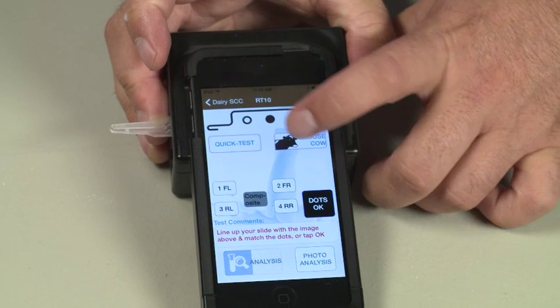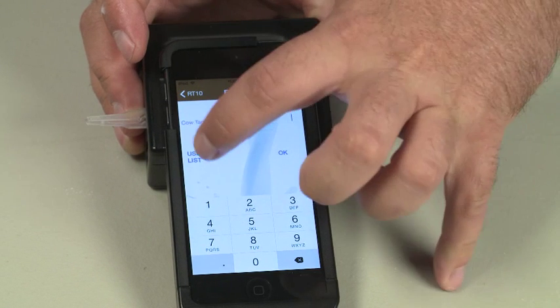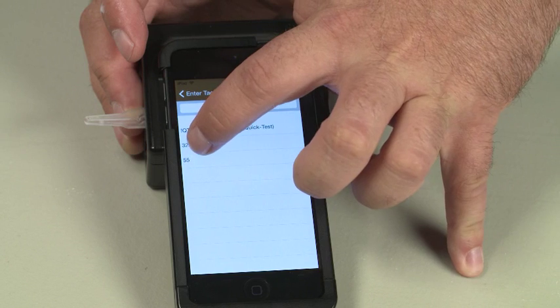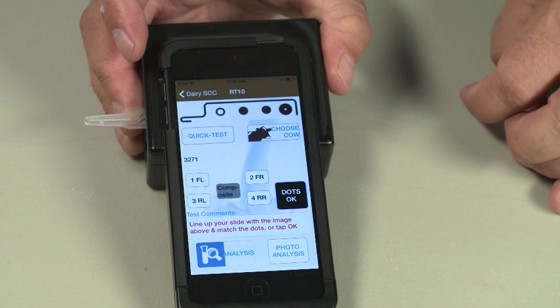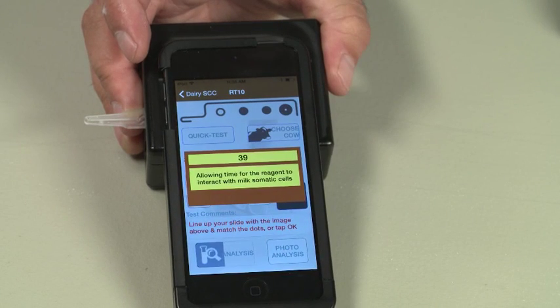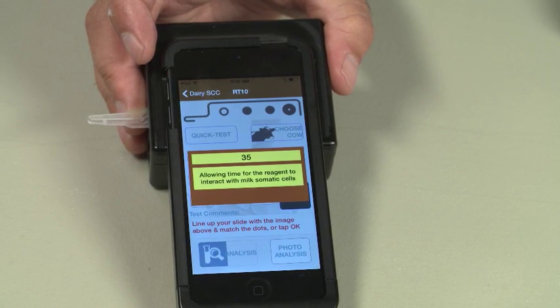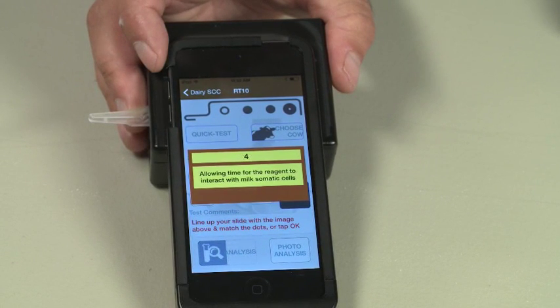After inserting the slide, tap Choose Cow to access your cow list. Please note this is not necessary for a bulk tank test. Tap Use Cow List to select a cow tag, then tap the cow you are testing. The app will return to the analysis screen at this point. Hit Analysis to start testing. You can also indicate the quarter the milk came from by tapping the quarter button on the app before you press Analysis.